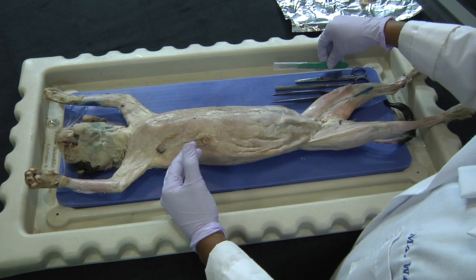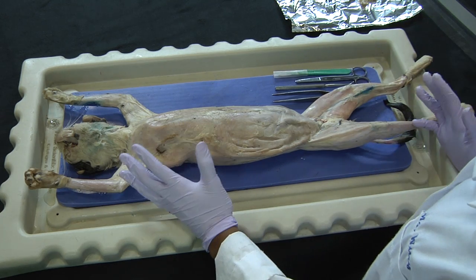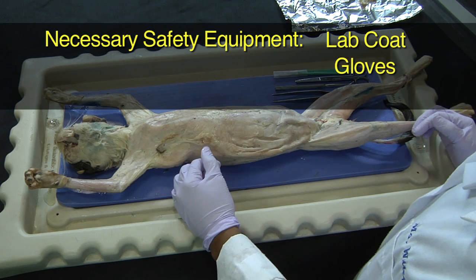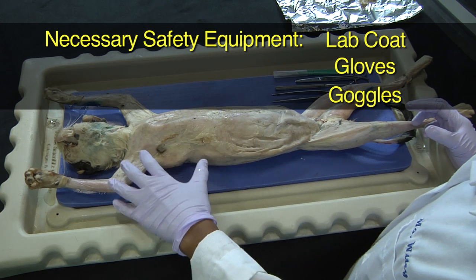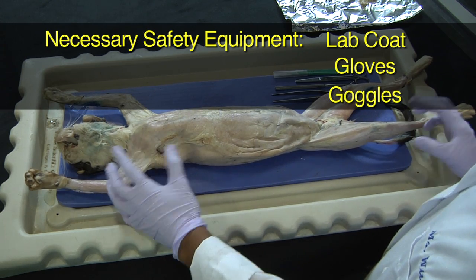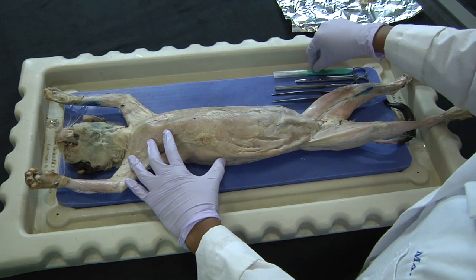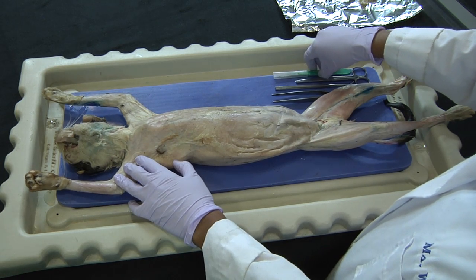In order to do this, certain equipment is needed. First, protective equipment, which includes a lab coat, gloves, and goggles. The fixative used to preserve these cats is toxic, so having a ventilated area along with eye and skin protection is very important.